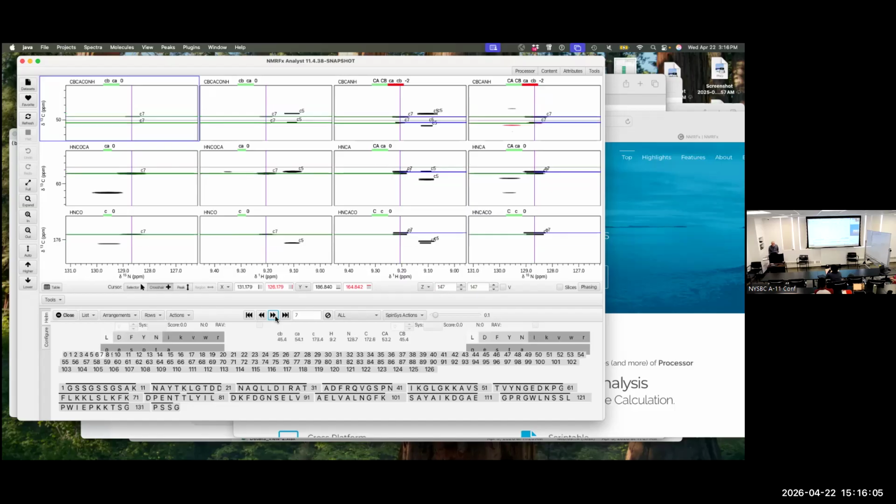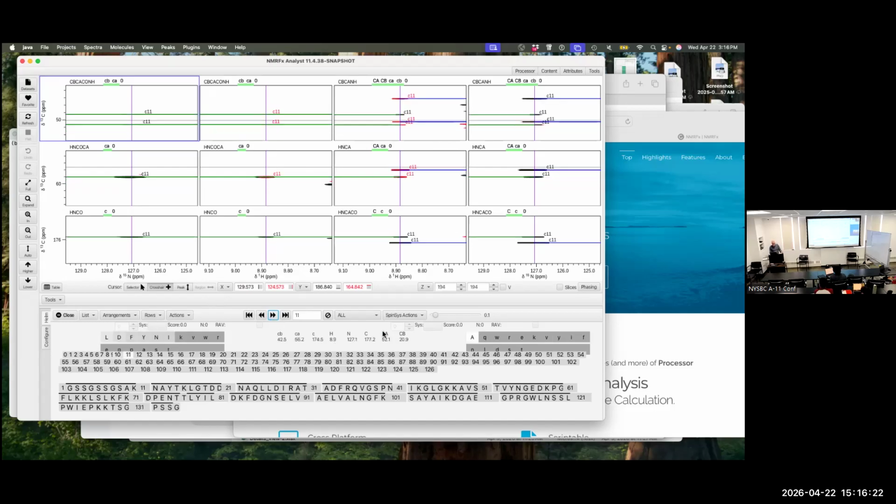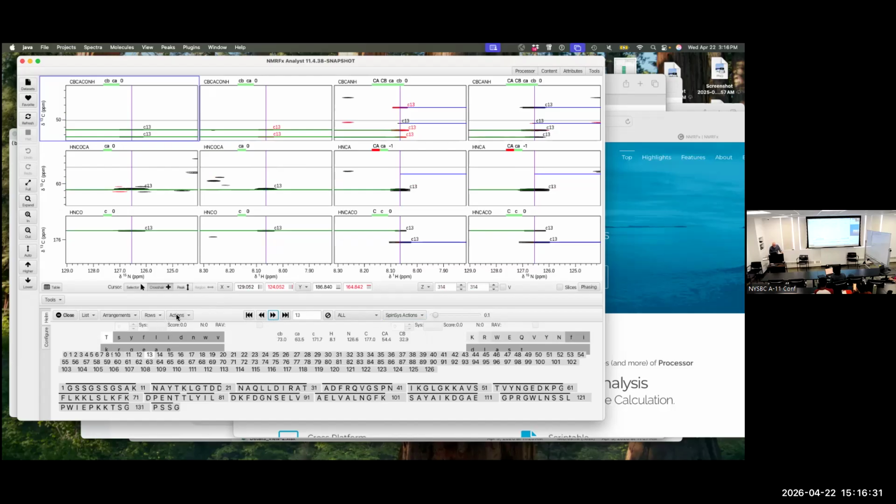So we can step through. At this point, you're just going to step through and come to values where there's red and it's missing 2 peaks, and think about it, dig down in the noise, maybe find peaks and add them in. Or there are too many peaks, and you go in and maybe delete what looks like the weakest artifactual peaks. We actually have a trim, which will get rid of the weakest peak that you don't expect. So you can go through and do all those actions. Okay. Match adjacent.